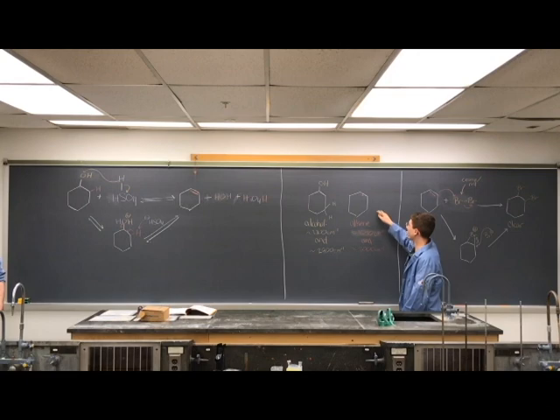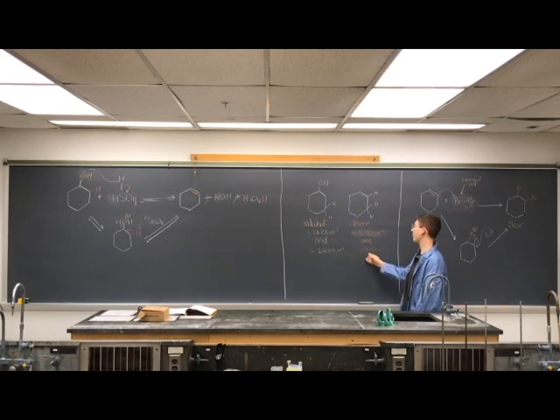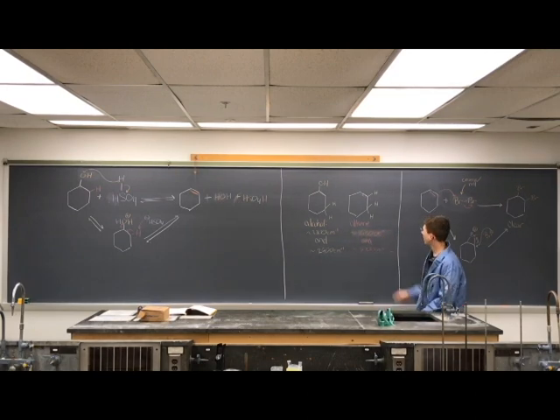Now when you move to the product, cyclohexene, you will also have sp3 hybridized carbons, but you're also going to have the sp2 hybridized alkene. For this hydrogen, you're going to get a band a little bit higher, around 3,000 wave numbers, and then for the C=C you're going to see around 1650. It might not be easy to see, but we'll see after we get the spectrum. So that's going to be our first way to characterize our product.